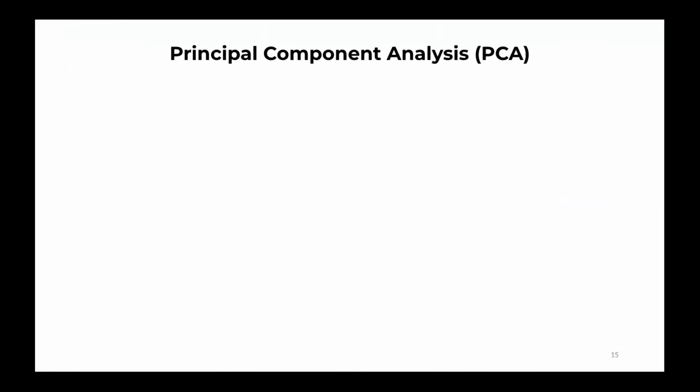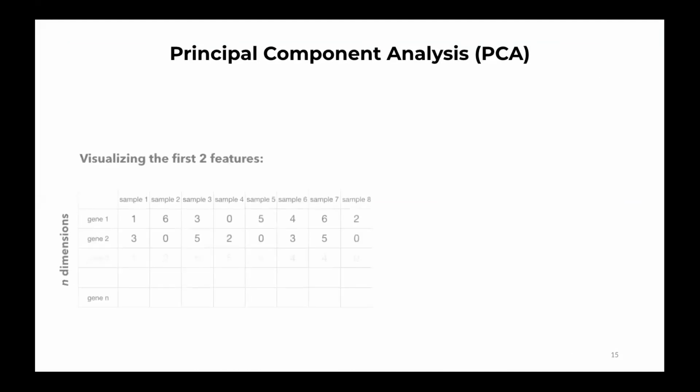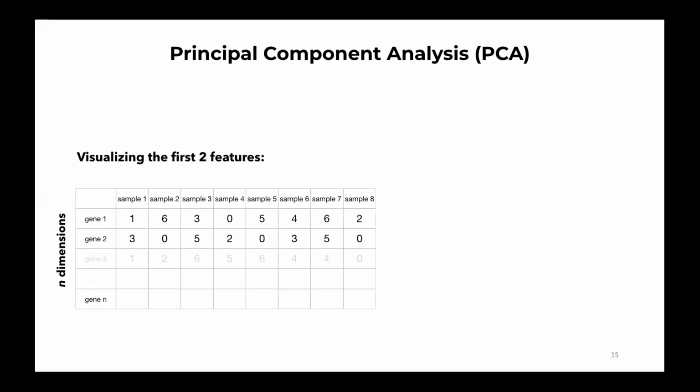To study how gene expression can be used to measure variability between samples, we can use a dimensionality reduction technique that is quite often used in RNA-seq data, and it's a very popular technique in bioinformatics as well. This analysis method will help us visualize the multidimensional data set. So I will be explaining what I'm talking about in a scatter plot, and see what the gene expression pattern shows about the data.